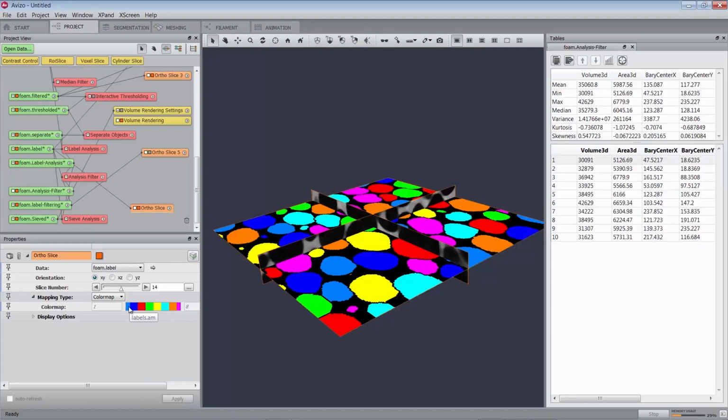In the label image created along with the results spreadsheet, each particle has been identified and assigned a unique index. This label data is stored in this case as a 16-bit label image. Such images are displayed by default using a cyclic color map so that particles in close proximity are more likely to be shown in a different color.